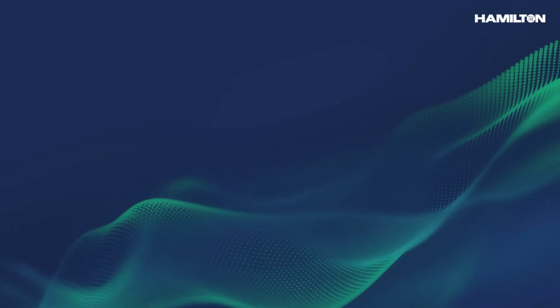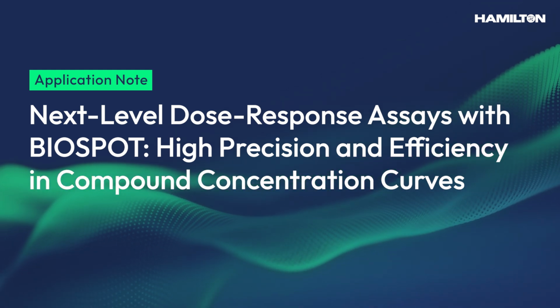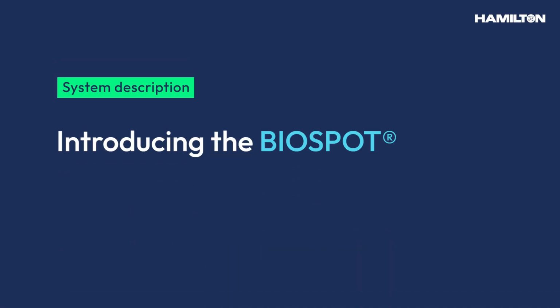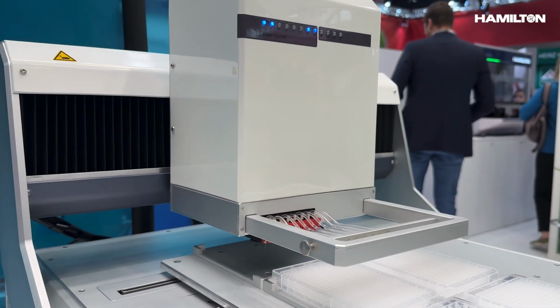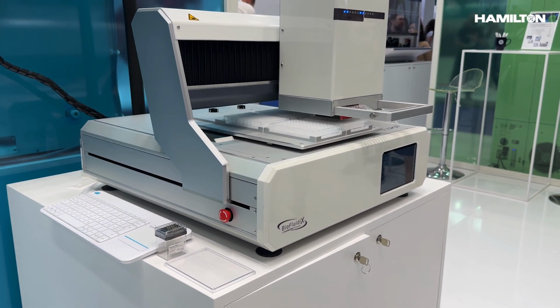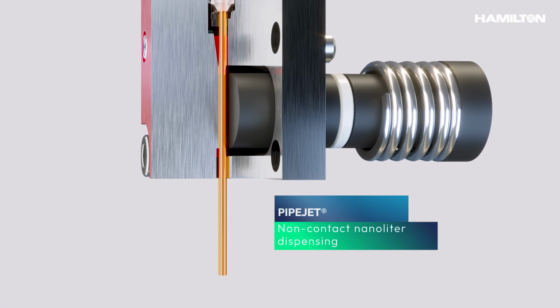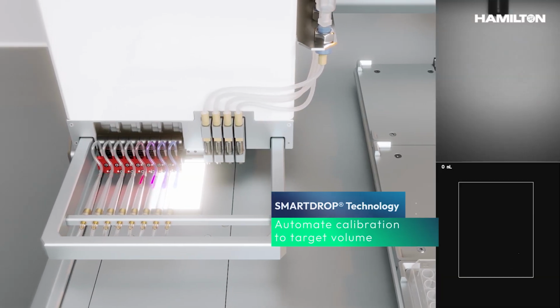Are you working with dose-response assays? A recent application note describes how the BIOSPOT workstation can be used to achieve high precision and efficiency in compound concentration curve. In this app note, the Hamilton BIOSPOT is used to simplify dose-response curve generation with precise nanoliter dispensing. The BIOSPOT is equipped with 8 pipe jets for non-contact nanoliter dispensing and the Smart Drop technology for automated calibration of the target volume.